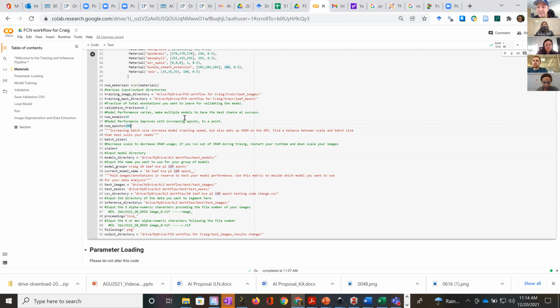So it really speeds things up when you use a generalized model. Instead of, I can't remember how long it takes Mason and Guillaume's code to run with a random forest. But if you have a general model, in an afternoon you can segment 30 stacks, which I think is a big speed up. It was much longer when we were using the random forest previously. Depending on the size of the stack, it would have taken 2 hours.